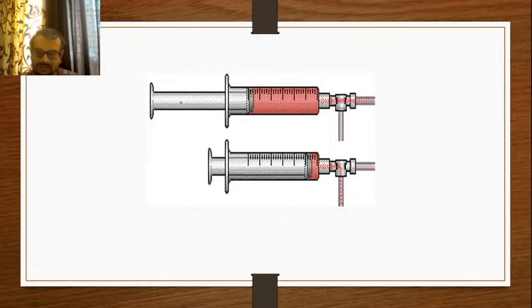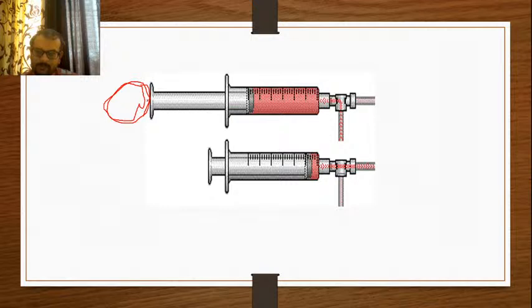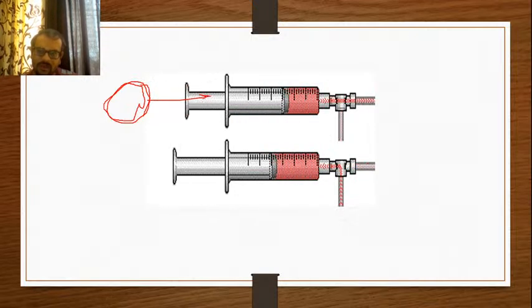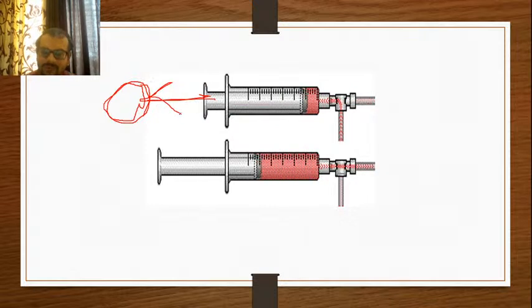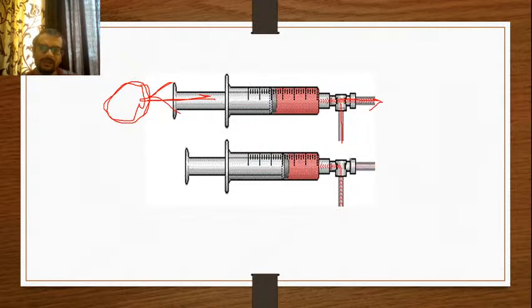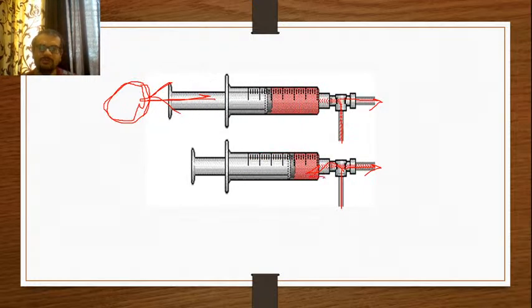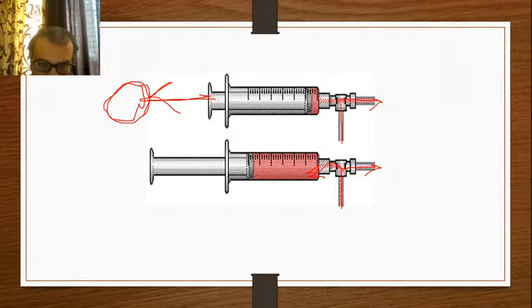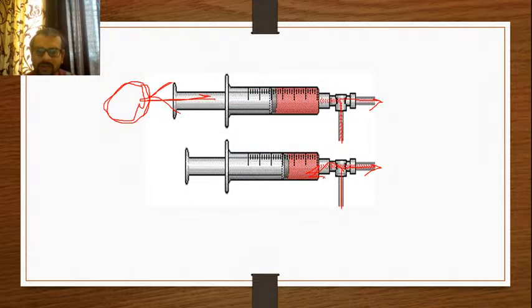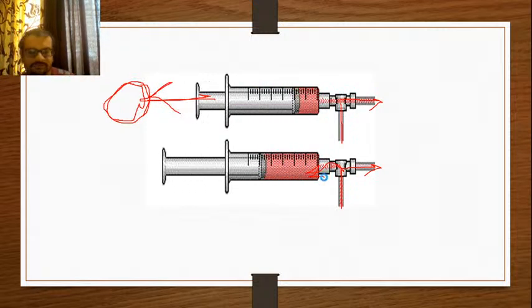This hypodermic syringe movement has been facilitated by the motoring screw. Okay, it is an automated system which helps this hypodermic syringe move forward and backward at a time, and that's why the inward entry and outward entry of the mobile phase can be facilitated. You can easily visualize this technique. Inward and outward, but the only thing is it produces a finite volume at a time, and we cannot say that a large volume can be introduced by using a syringe type pump. Okay, so that's all.